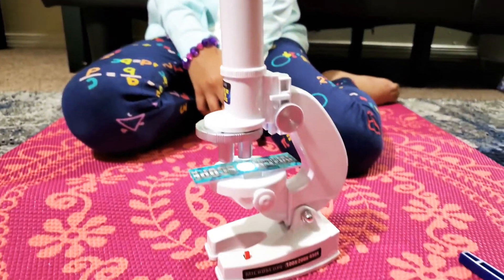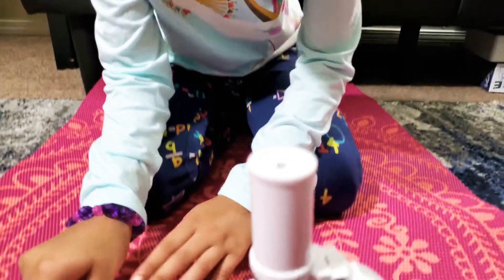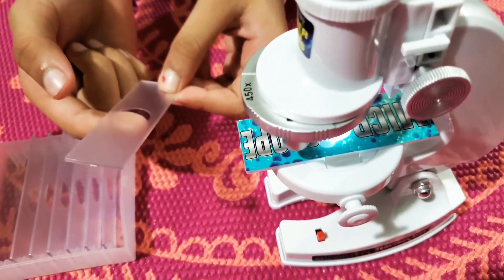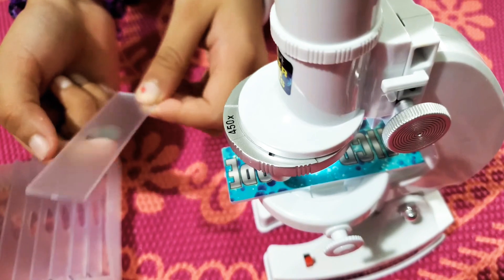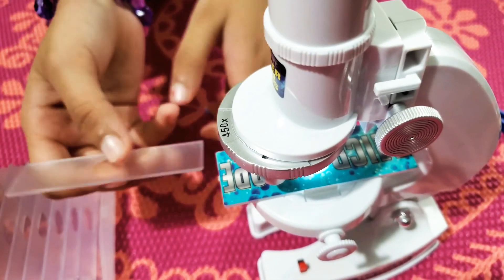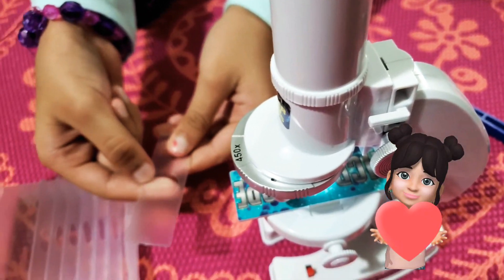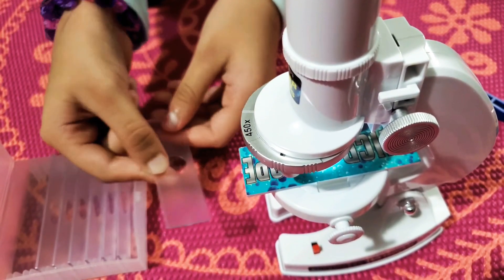I like this microscope — this will be my favorite toy. This is a nice scientific toy. There are seven slides here, and you can take an example — you can put slime, sauce, any type of food or toy, put it on the slide and see what is in it. But if it's plain and you just put it under light, you can't see anything except a white light. That's all we have today — I hope you enjoyed my video. Bye bye!